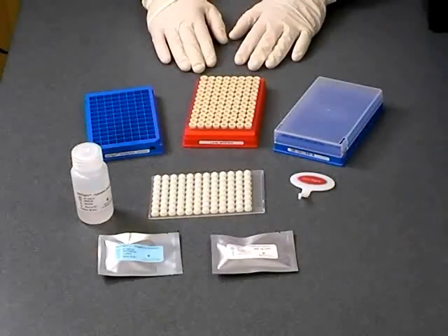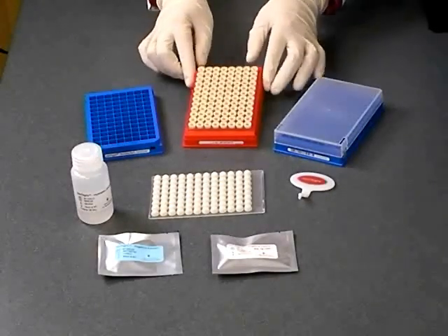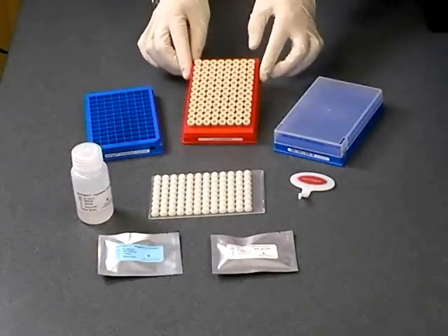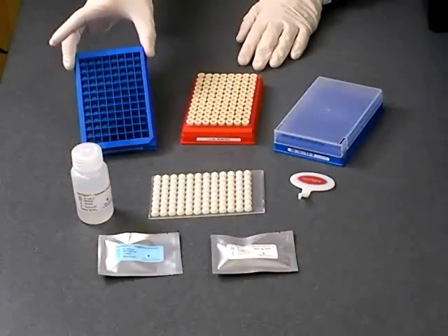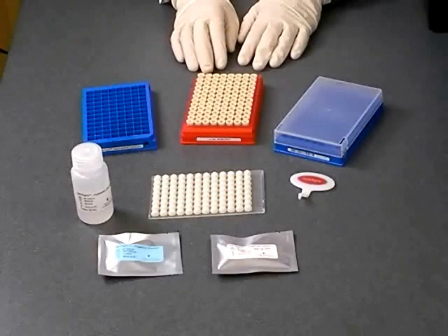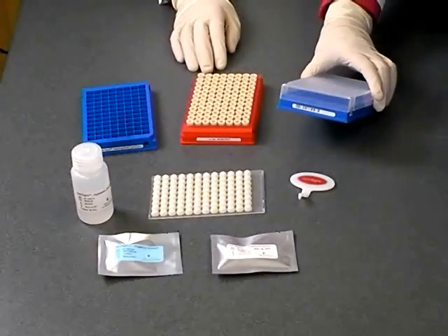Gentegra DNA tubes are available in a variety of packages, but GenVault recommends beginning with a kit format instead of individual racks. A starter kit includes a rack of 96 Gentegra DNA tubes, a 96-position working rack, and a 96-position storage rack with barcode.